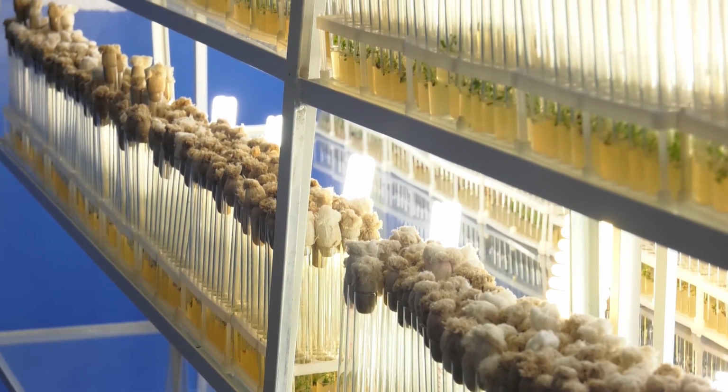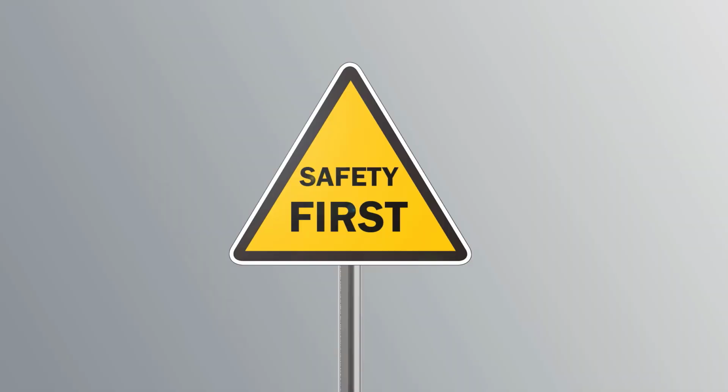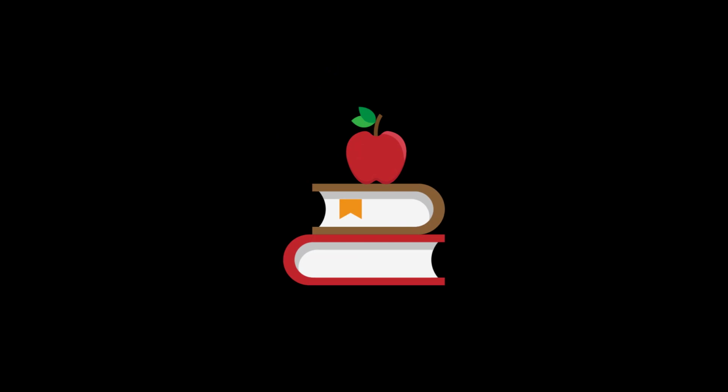Never remove specimens, cultures, or equipment from the laboratory unless specified by your instructor. Before leaving the laboratory, carefully wash and disinfect your hands, decontaminate your workstation, and gather your belongings for the next day.